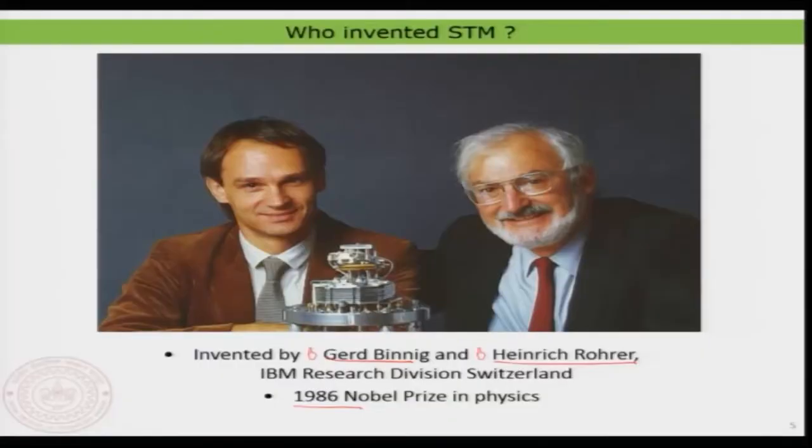but this discovery was recognized immediately, after 5 years, because this is one of the most important discoveries where people could for the first time ever see atoms in real space. Some of the most unsettled questions were also answered immediately, because seeing is believing. If you have a photograph, you believe that. So here you have images of the surface, so you will believe it. That's the most exciting part about it.